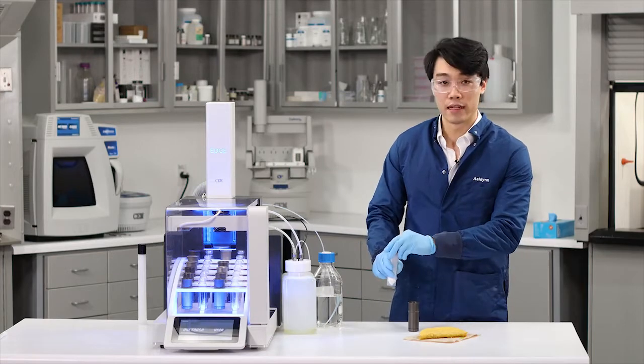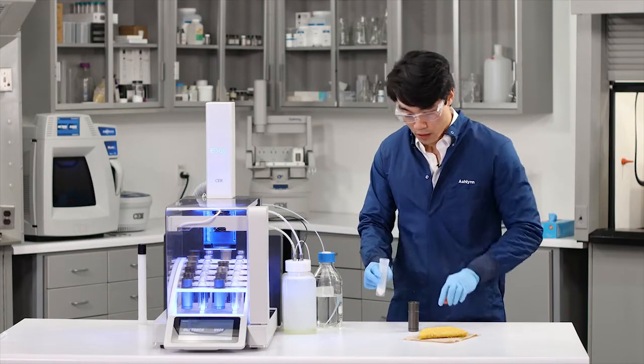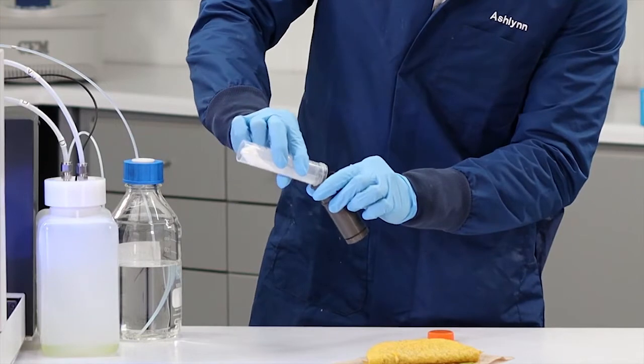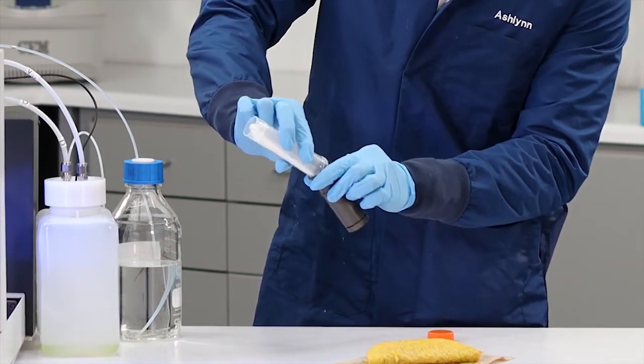First thing I'm going to do: take a little bit of the absorbent that we're going to need, weigh it directly into this Q cup that we have pre-assembled with the Q disc.